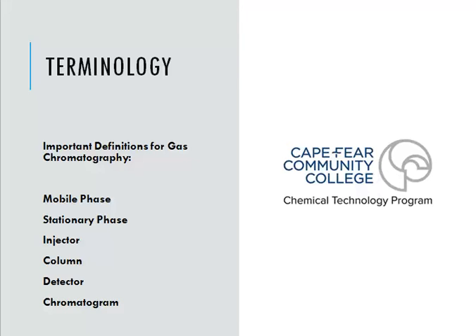Okay, are you ready? Are you ready to talk about gas chromatography? If so, get out your pencil and your paper because we're shortly and quickly going to turn into an art class, because we're going to get ready to draw what the GC system is going to be doing for us, with an overall scheme, an overall picture of what goes on inside of the GC system itself.